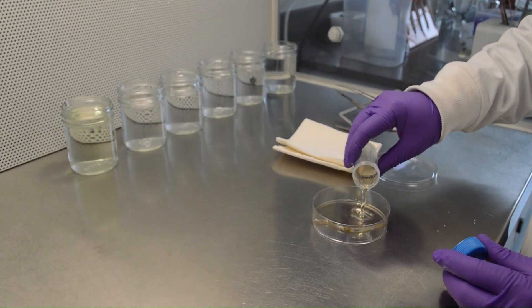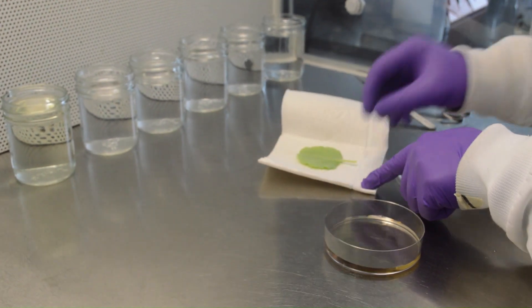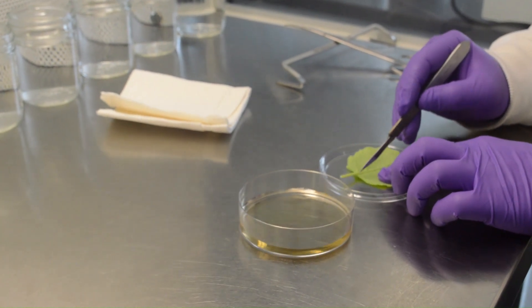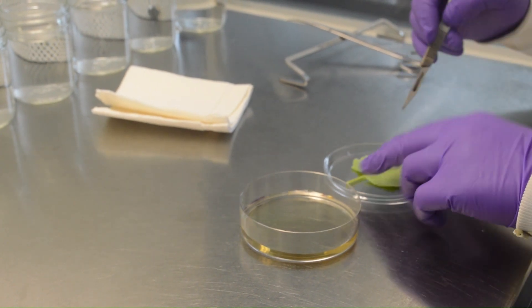Pour 25 milliliters of digestion media into a petri dish. Cut the leaf into small rectangular strips about two millimeters, thereby avoiding the central vein. The volume of digestion media, size of plate, and plant material can be adjusted as needed.